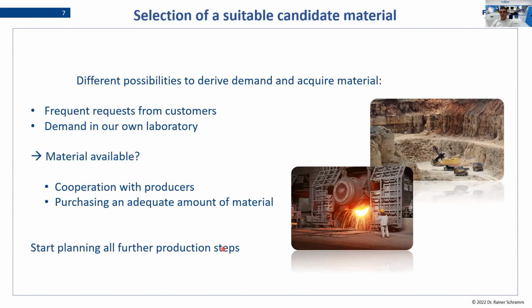We then come into the discussion of whether there is a material available, whether there is really enough interest from other people for this material, and how much work will be involved to establish this material as a certified reference material. So it's always worthwhile from your side to ask us and to make some proposals, because this makes sure that the reference materials we then have in our portfolio are really what you need for your daily work.